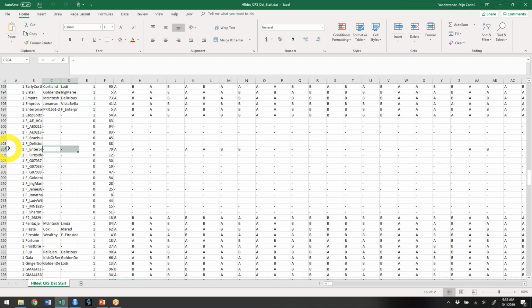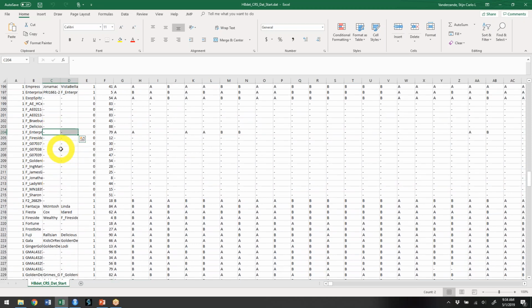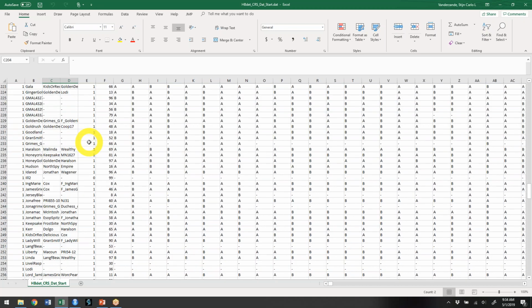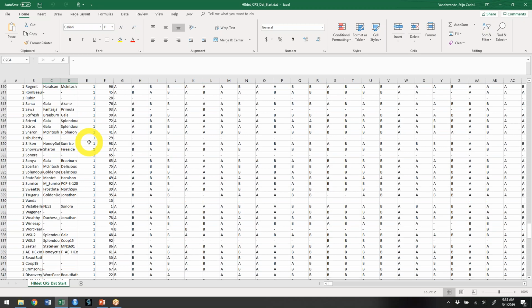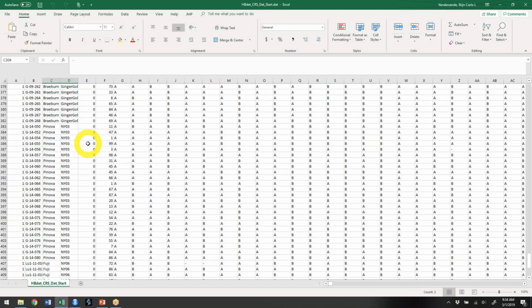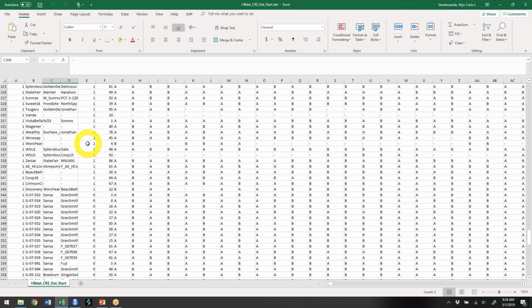Given that this wasn't a genotyped intermediate parent, but we do know the ancestors, it's good that these are now missing, because that way we're not removing our intermediate ancestors from our data set, but rather just cutting the ties with everything further up in the pedigree, which is enough to get accurate phasing. And I believe that in this file there are no intermediate ancestors, but I can show you. There's a few that will come back.